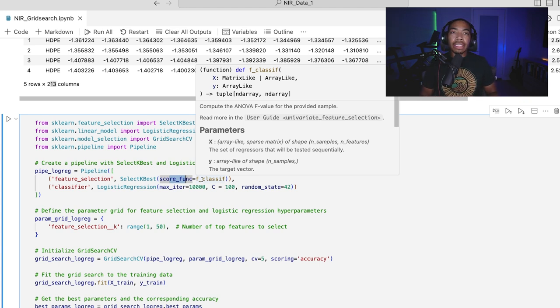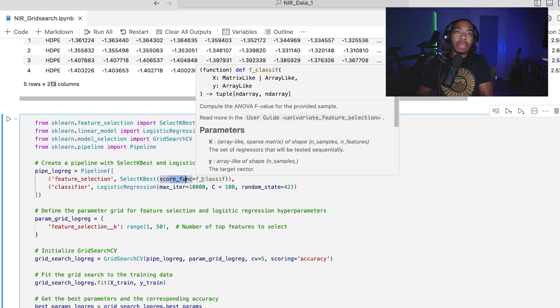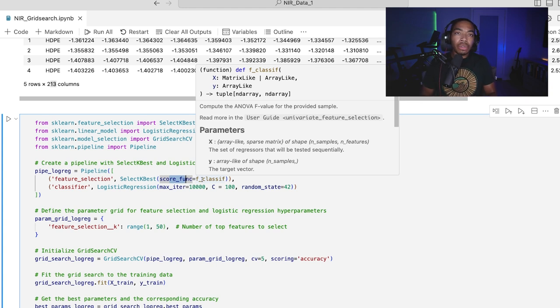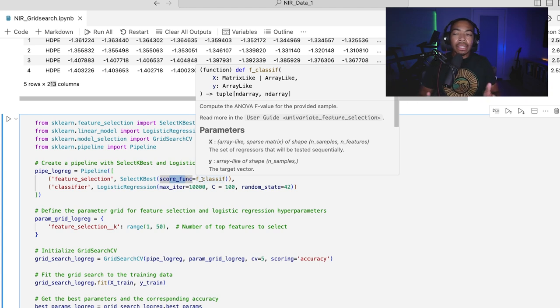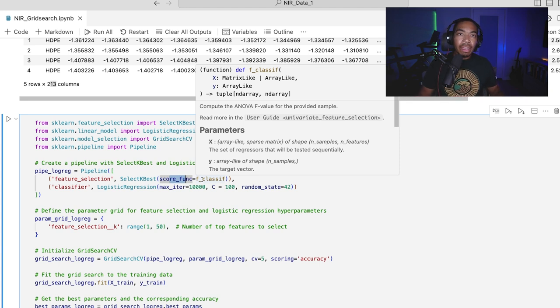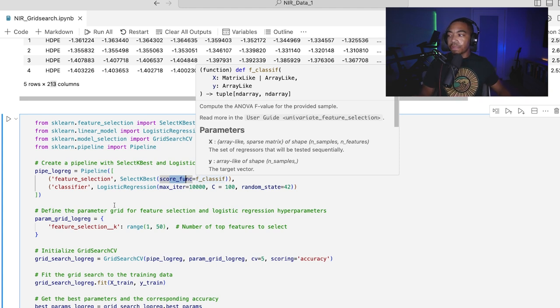And the values that will survive this analysis are going to be the variables that are most distinctive or most discriminatory between our various classes of materials. And so we can use a P-value to help us to determine that.